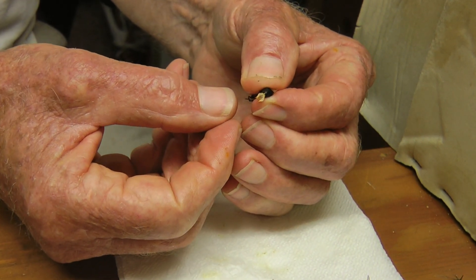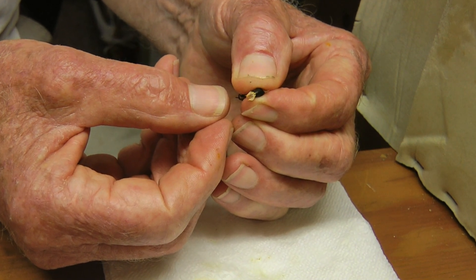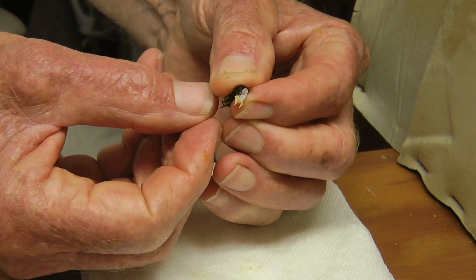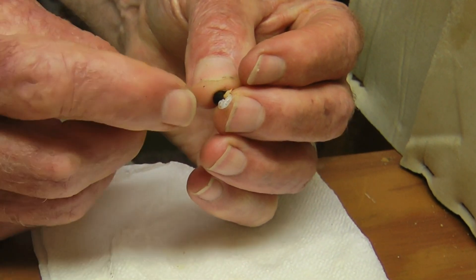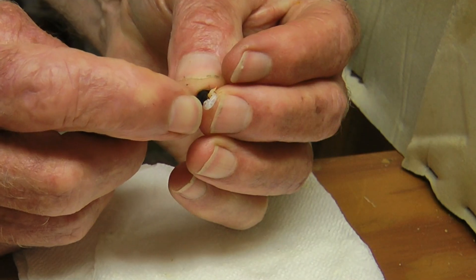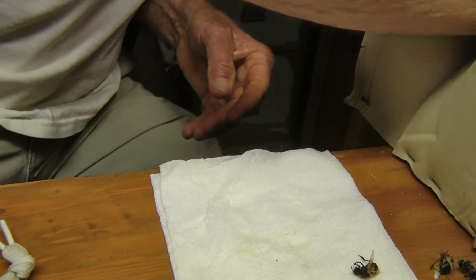Now I grab the base of the abdomen and I squeeze it. And the endophallus pops out. And the semen is down in here. Let's do another one here.